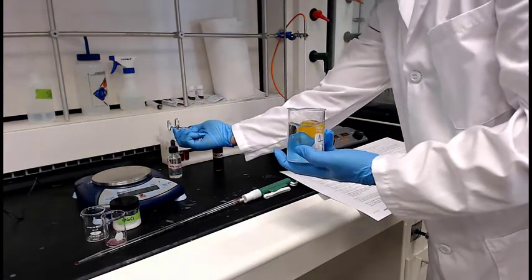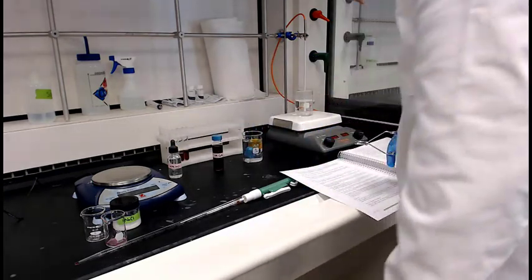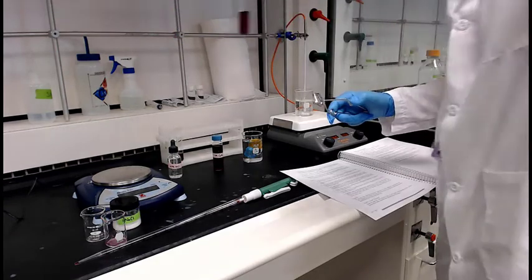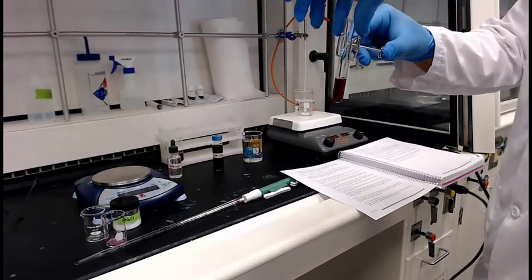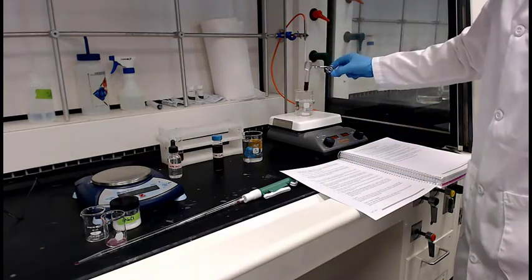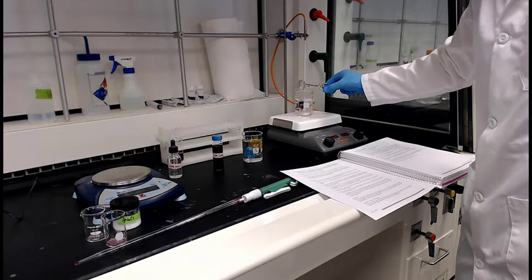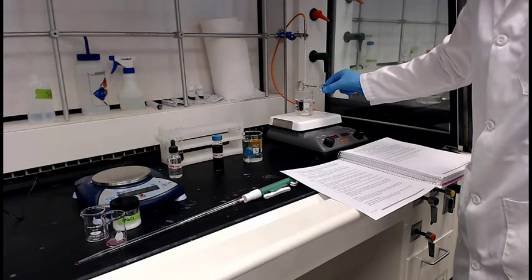Okay, so that is all the way through 7, 8, where they've repeated. Now what we're going to do is take that third test tube and put it in the hot bath. Well, so let's just see if, independent of having any kind of, there we go.